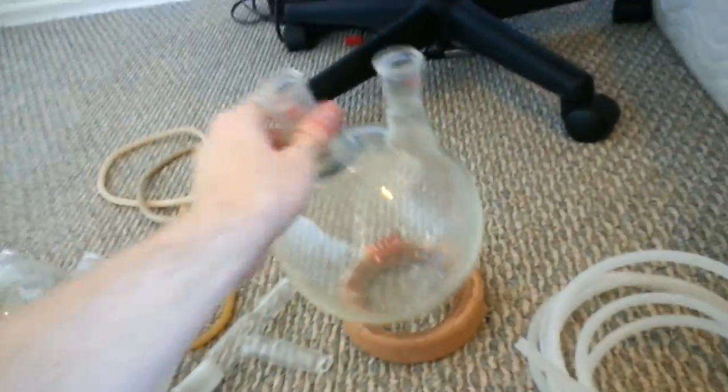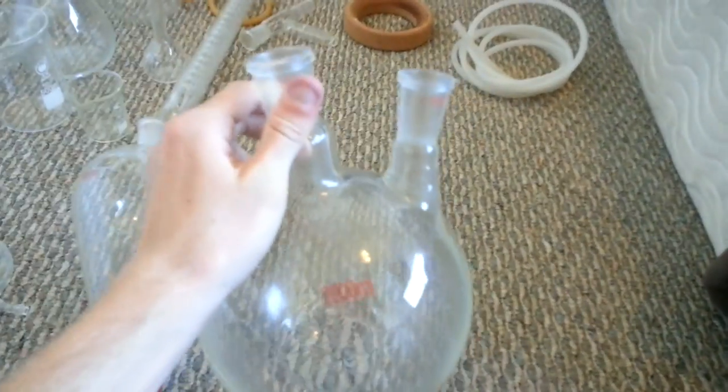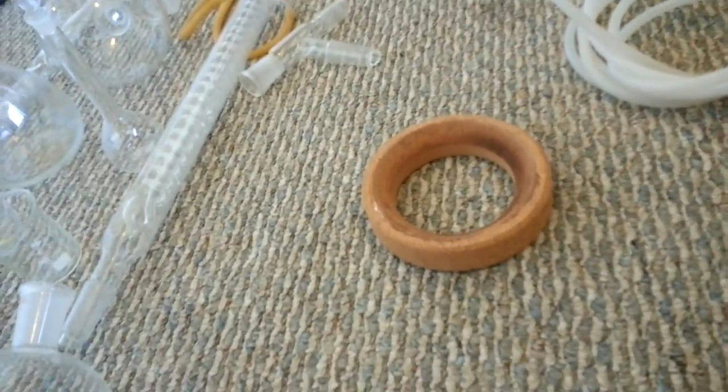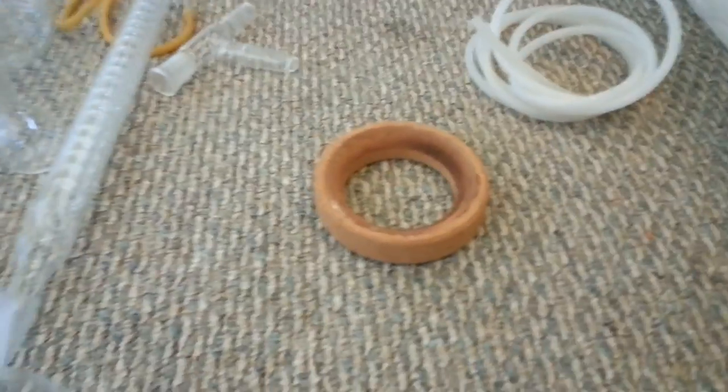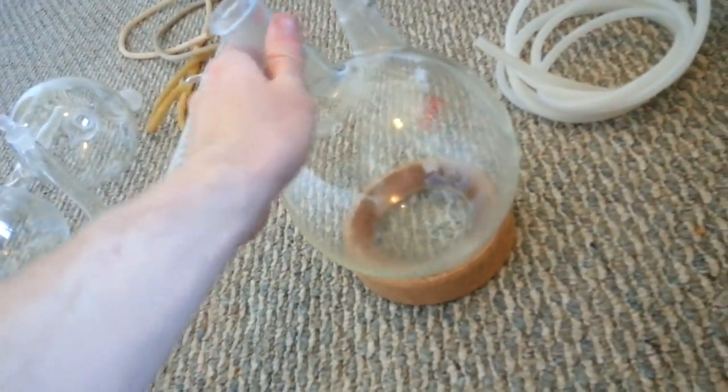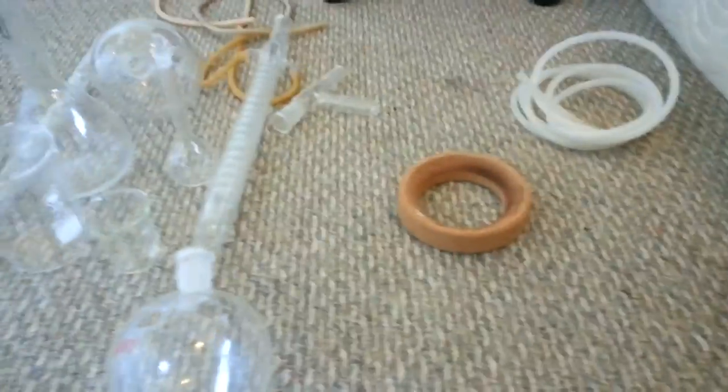Here's the 2000 milliliter round bottom flask with two necks — good to have. This is just a little cork stand. It's good if you want it, but you really don't need it. It's for putting the round bottom flask on so it stands upright. You can probably make one yourself rather than paying too much money for it. This was like $12 — it's just a piece of cork.